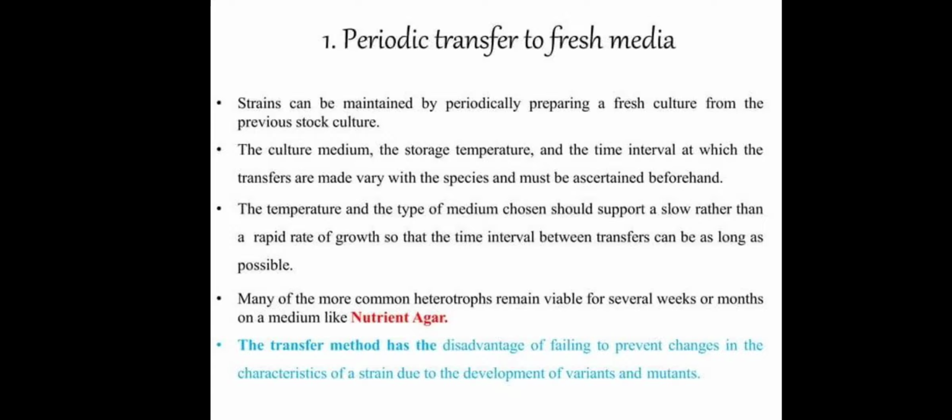Many of the more common heterotrophs remain viable for several weeks or months on a medium like nutrient agar. The transfer method has the disadvantage of failing to prevent changes in the characteristics of the strain due to the development of variants and mutants.